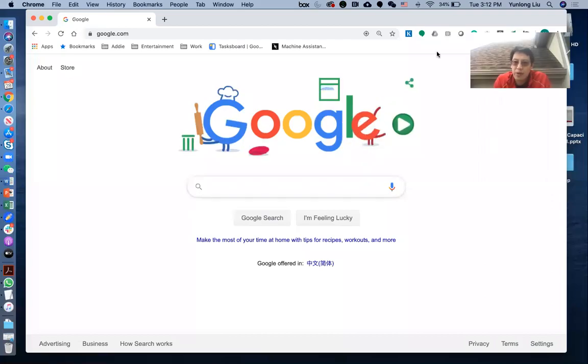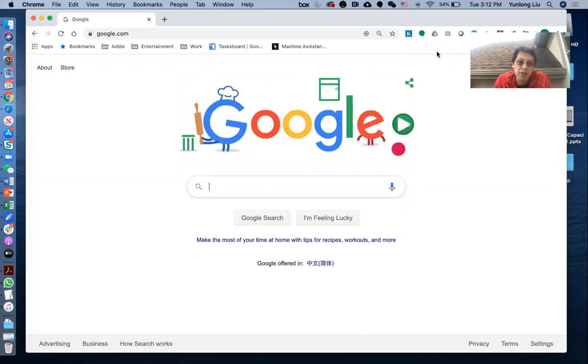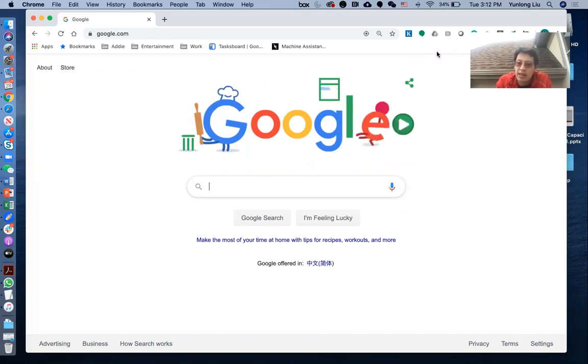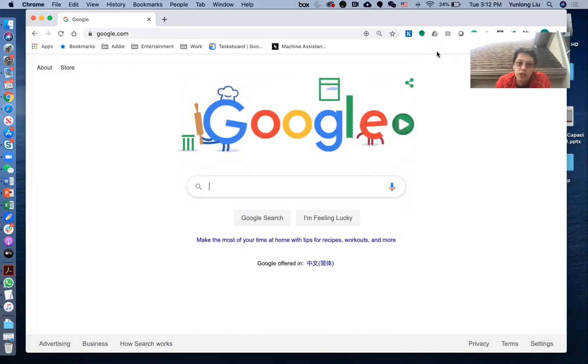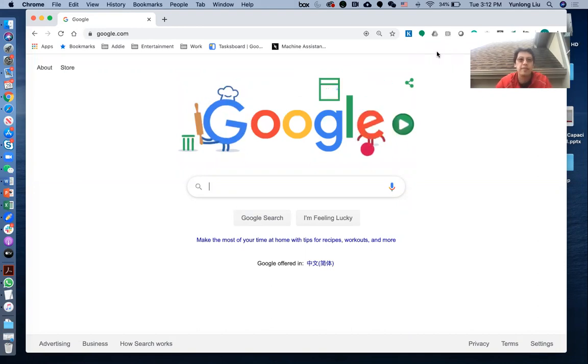Hi, this is Dr. Yunlong Liu. In this short video, I'm going to demonstrate how to use UCSC Genome Browser to visualize your own data.